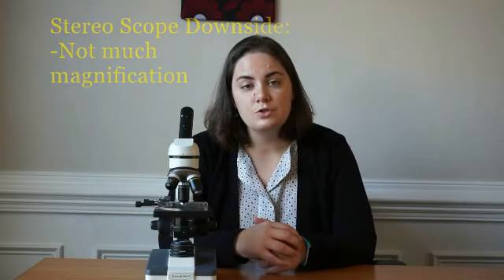Another note if you choose to purchase a stereo or dissecting microscope. If you have young children, because of the 2 eyepieces, they may not actually be able to see into both eyepieces at the same time, based on the distance between their eyes. If this is the case, I suggest that they just use the 1 eyepiece until they grow into the microscope.